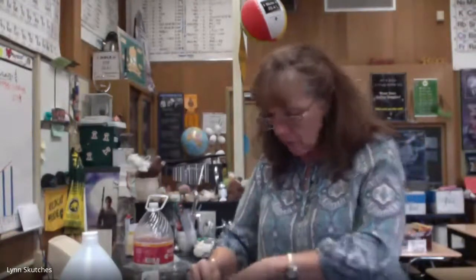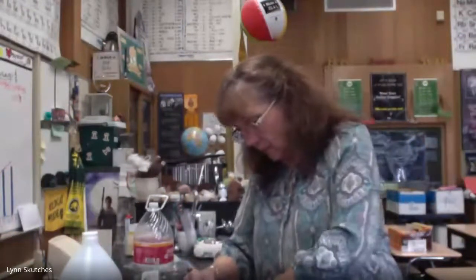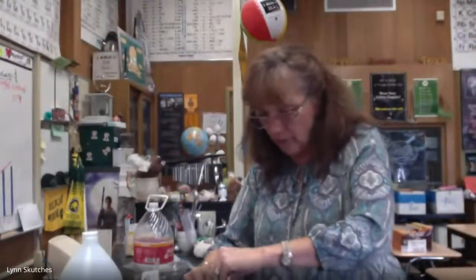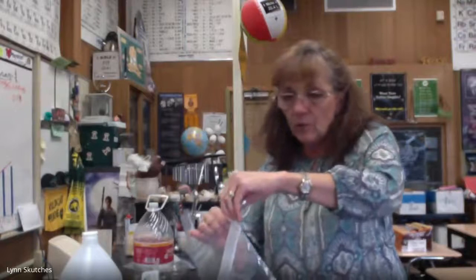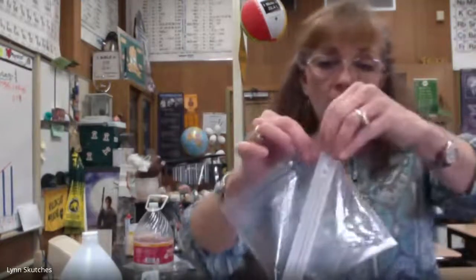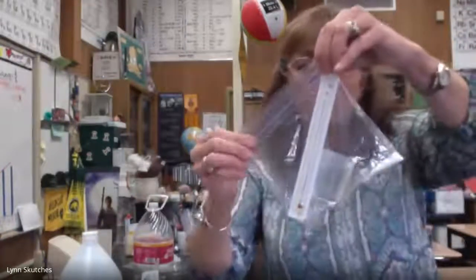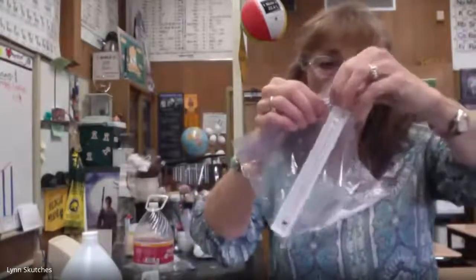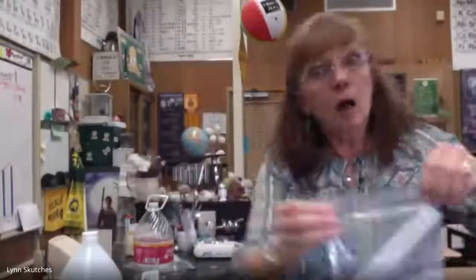So what you're going to have to do is do a little finagling. Try not to tip it over. You're going to make it so that the thermometer, the beaker of vinegar, and the baking soda all live happily ever after. Yep, we started. Oh well, make sure the bag's zipped. I already lost a bunch, I'm sure.